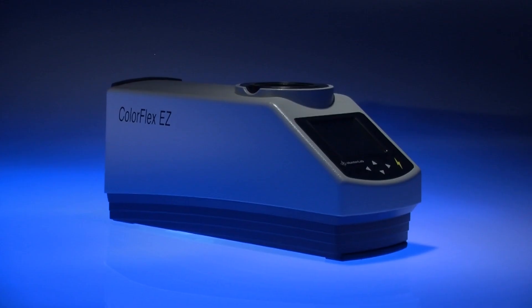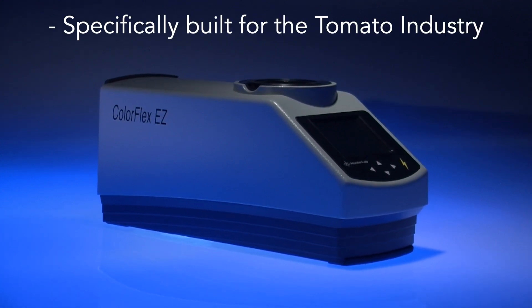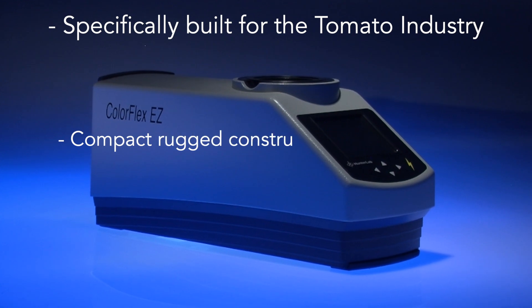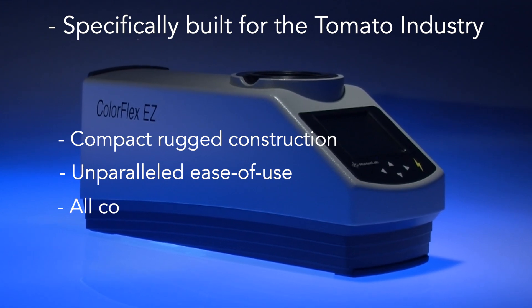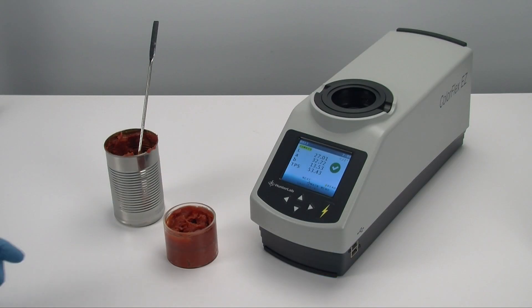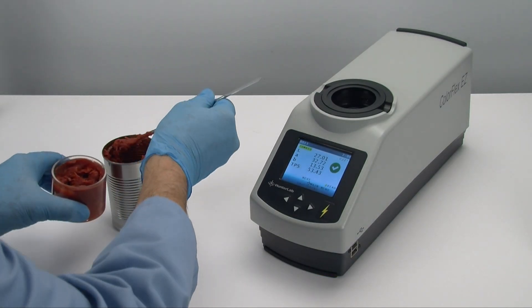Hunter Labs ColorFlex EZ Tomato is specifically designed and built for use in the tomato processing industry. With its compact, rugged construction and unparalleled ease of use, the ColorFlex EZ is embedded with all the measurement scales commonly used in the tomato industry. Let's see just how easy it is to measure the color of a tomato paste sample.